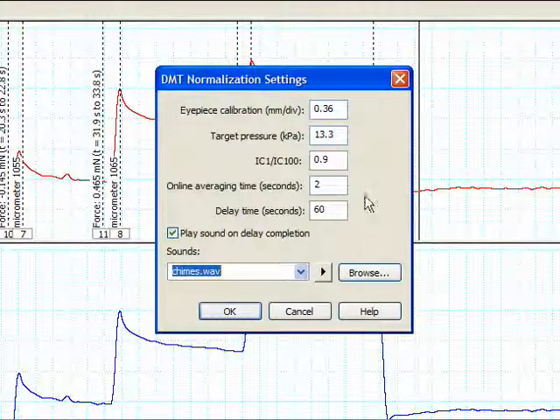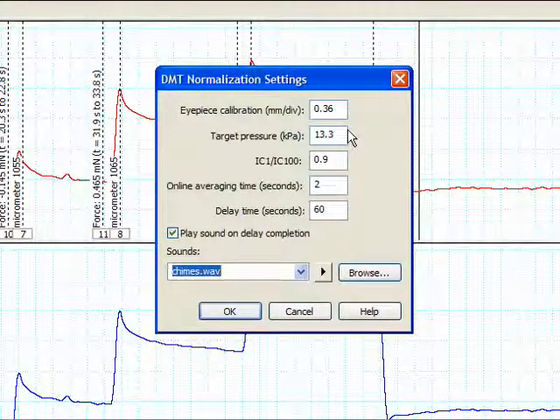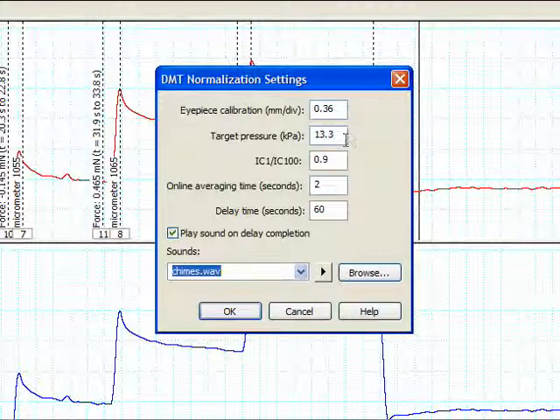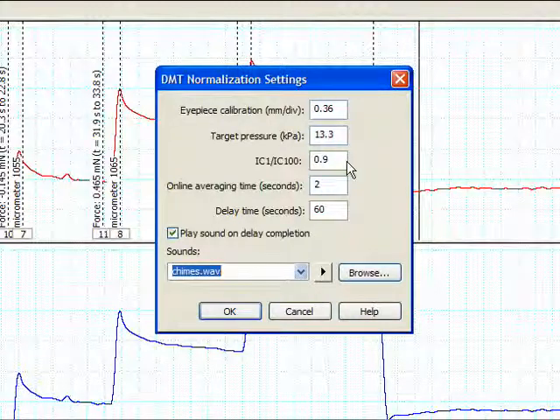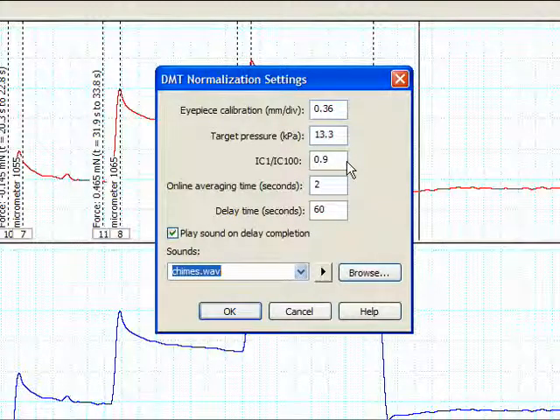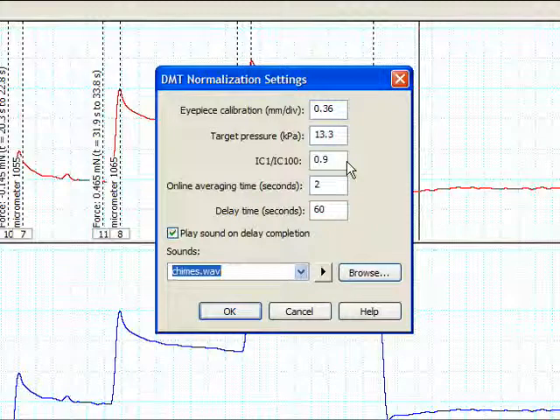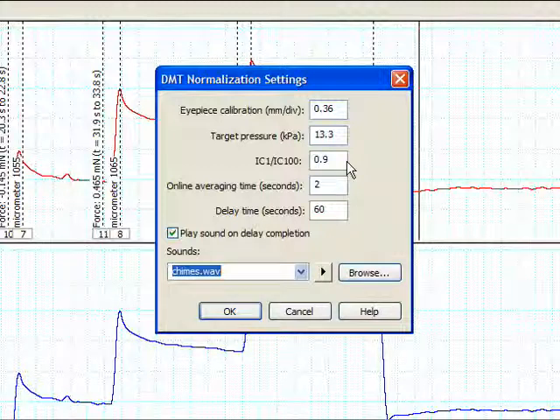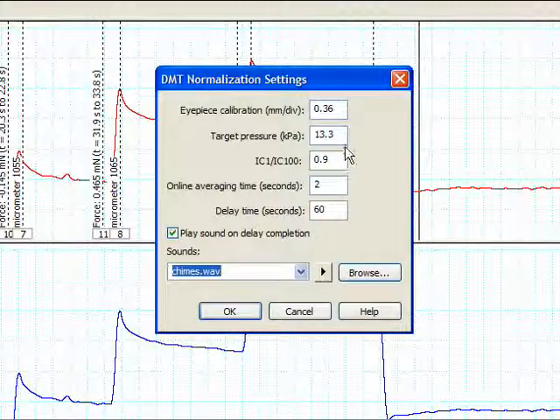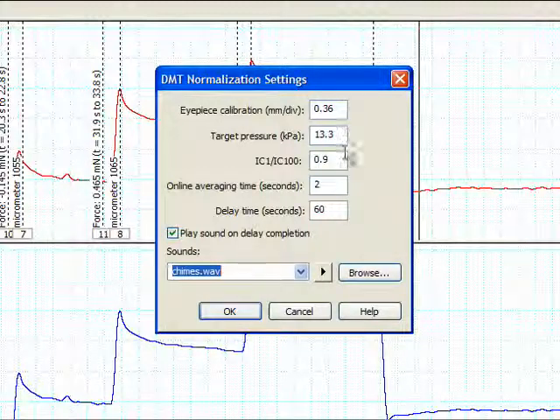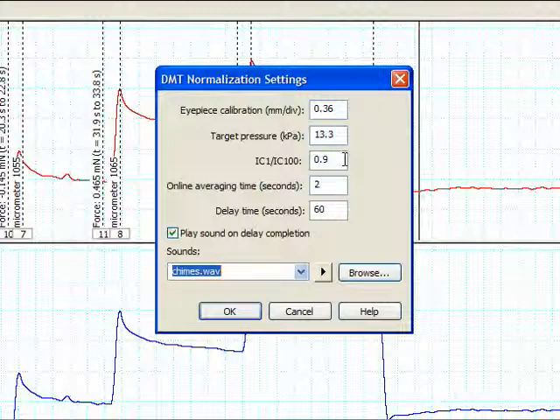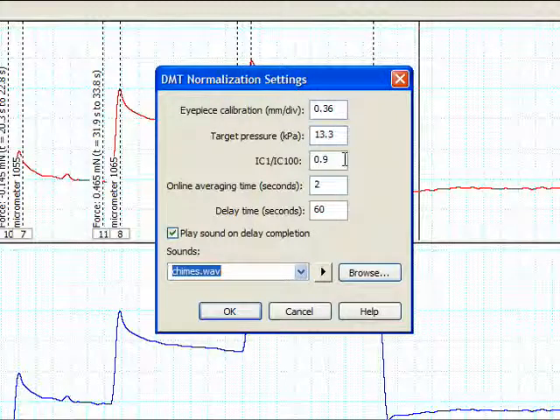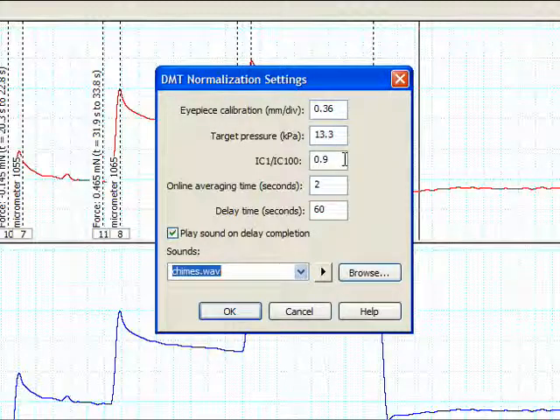Please note that parameters in the DMT normalization settings, especially target pressure and IC1 over IC100, are configured for the use of small vessels with the DMT system in the DMT normalization module. If other types of tissues are used, then experimental parameters, especially target pressure and IC1 over IC100, should be determined for that tissue.